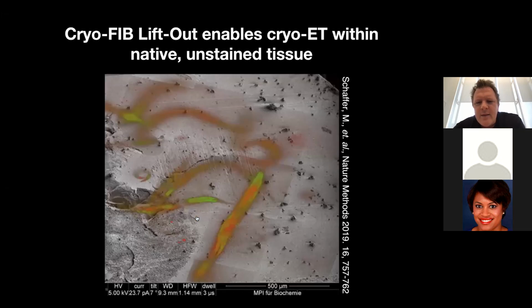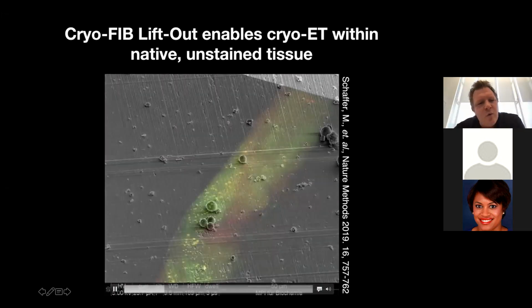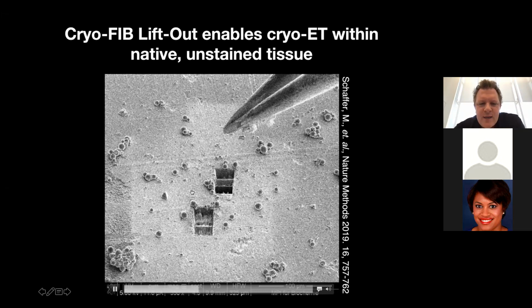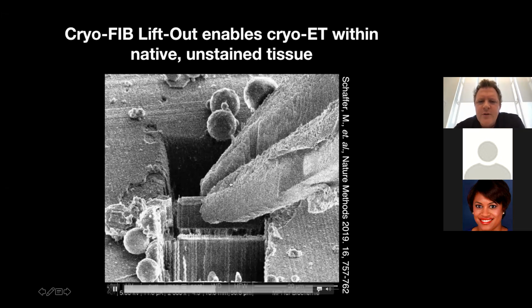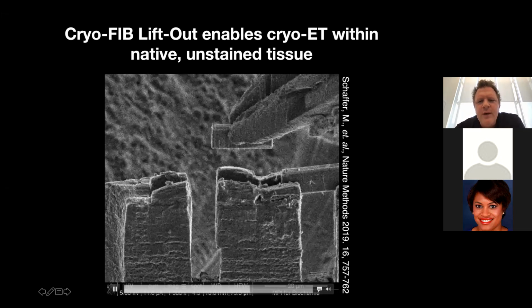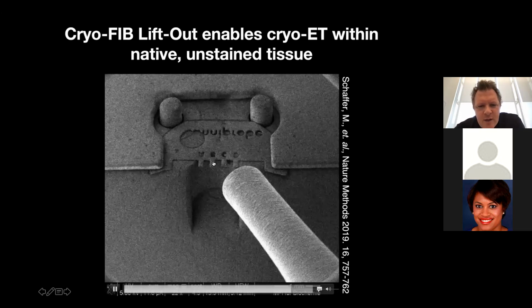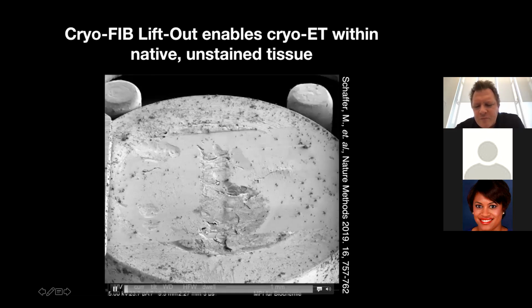And so this is where we're headed also in terms of human brain tissue, organoids, things of that nature. But it is much more involved because you have to, as I say, not just freeze and identify where you are, but also somehow lift out this very small section of the tissue, and actually then pare it down using your FIB-SEM, as it's shown here. You're actually thinning it down here, and then actually imaging this in the Krios.